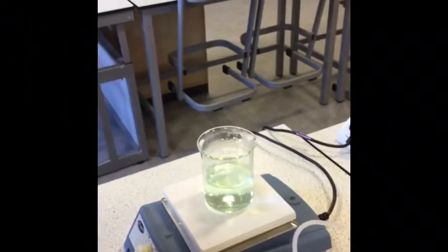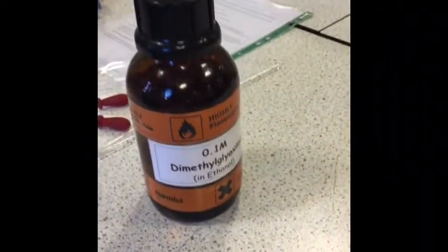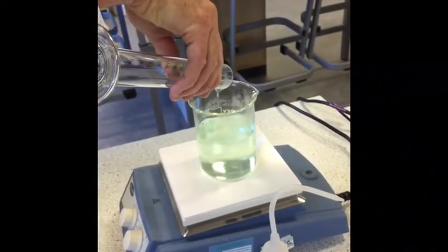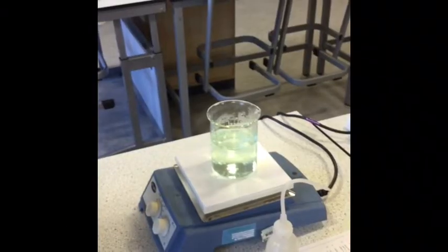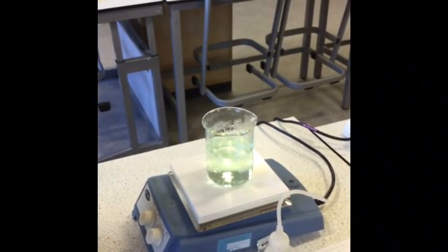And the next instruction is to add 50 cubic centimetres of the dimethylglyoxime. Okay, so let's add that. So that's the ligand which is going to form a complex with the nickel, but it will only happen in an alkaline solution.